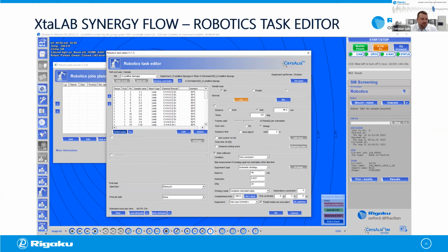Then, of course, you could dial in certain conditions that you would like to have for the measurement. You could either say, please give me a time constraint data collection, measure anything that is shorter than 1 hour, for instance. For the type of strategy, it can be fully automatic, or you can have a predefined run list, of course. For instance, here we have now a complete data set, redundancy 4, maximum 3 hours. After each individual measurement, you could also say, please dismount this, or keep one of the samples mounted.